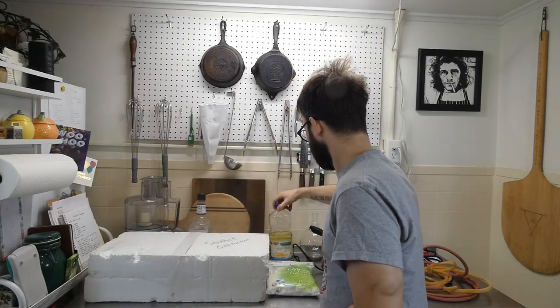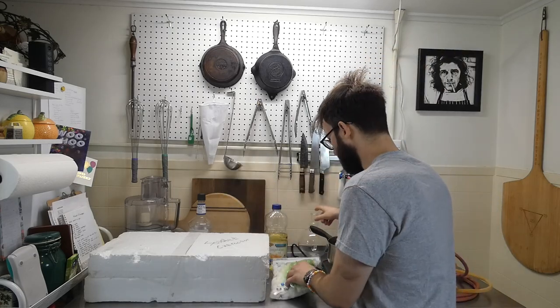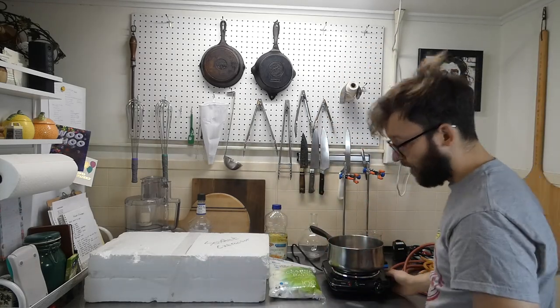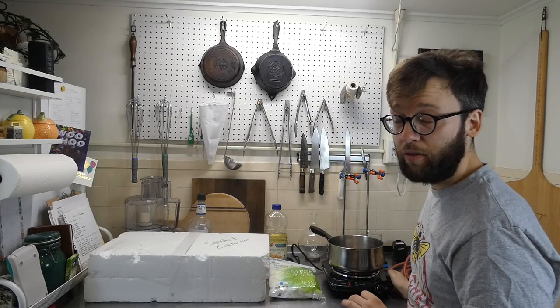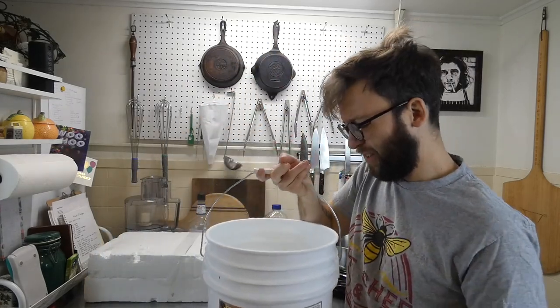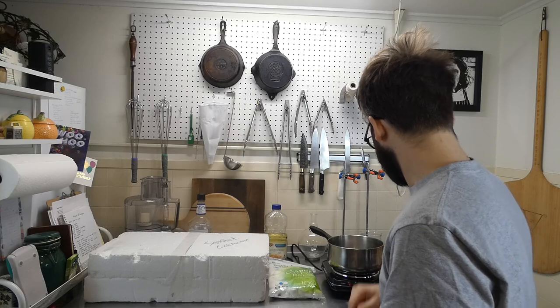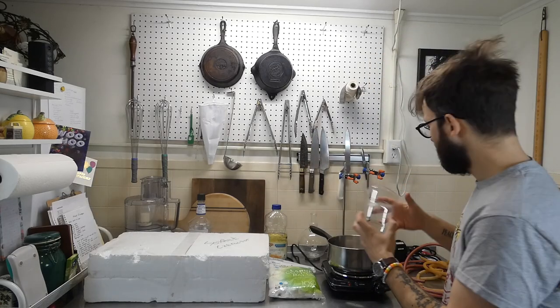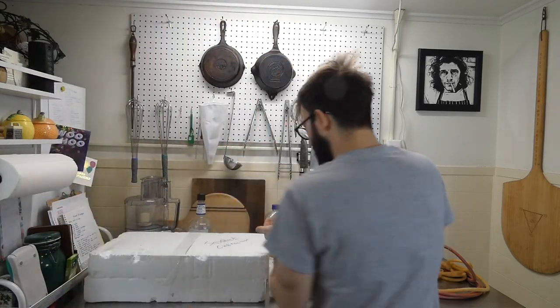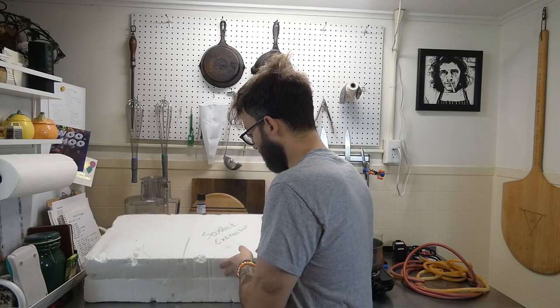You're gonna need your peppers, vegetable oil, some Vaseline, two ring stands with clamps. You're gonna need a 1,000 milliliter round bottom flask. You're gonna need cotton balls, an aquarium or fountain pump. You're gonna need two things of tubing. You're gonna need some kind of hot plate. Do not use open flames. That's not recommended at all, so just don't. You're gonna need a pot of some sort. Then you're gonna need a 5-gallon bucket filled about a third of the way with cold water. You're also going to need a bag of ice. Mine's in the freezer right now. Pull that out in a bit. And you're going to need a 500 milliliter beaker or something to measure with. And you're going to need some boiling chips. If you don't have boiling chips, just do what I do and break something that's unglazed, a ceramic or porcelain. And then finally, you're going to need your Soxhlet extractor.